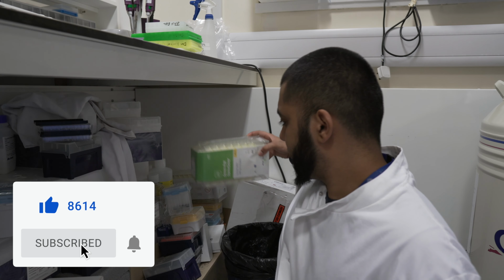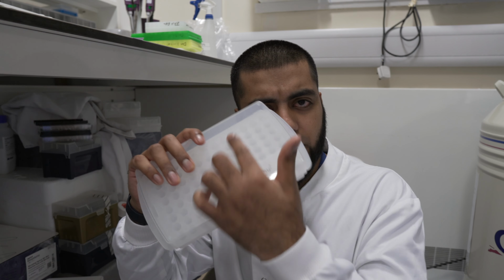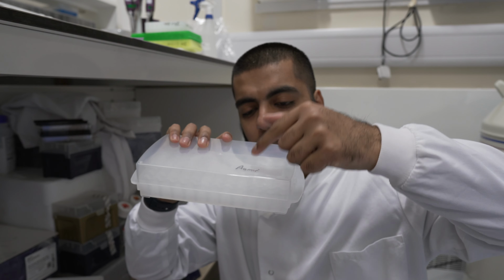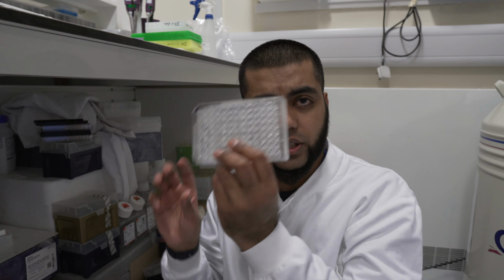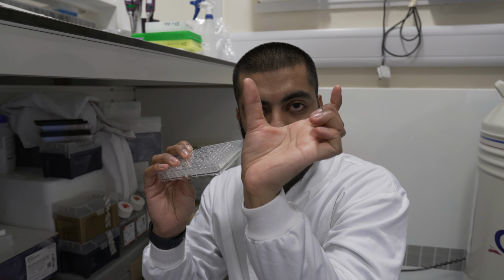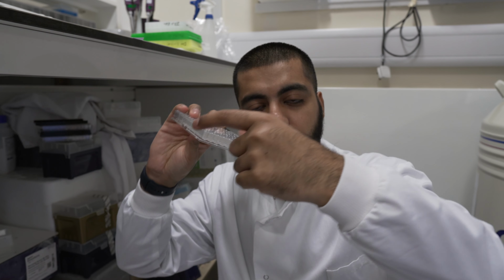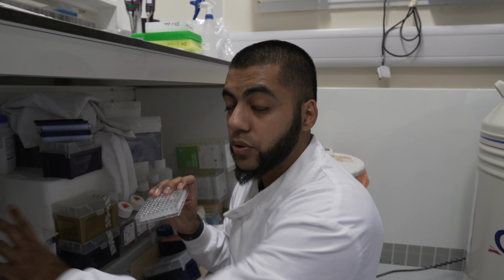Because what it does, imagine you have a tray of samples in this tray over here, and you put a multi-channel to grab stuff from all of the samples, and then you want to put it into a 96-well plate, which is like this. Obviously, it won't fit because the spaces are different. But what this pipette does is allows you to swivel and narrow the distance between the tips, so you can squeeze it to fit in here, and then you can expand it to fit in here. So I'll show you how I use that in the future videos.